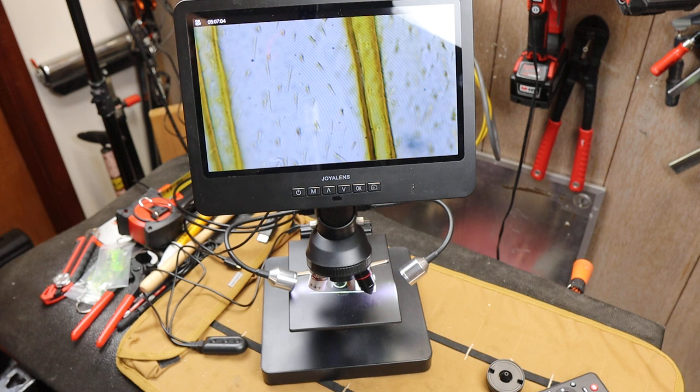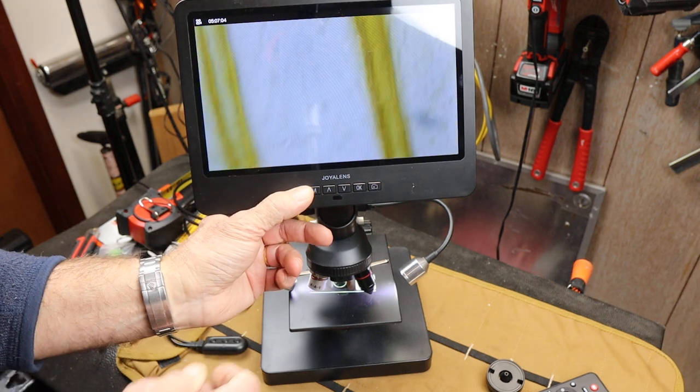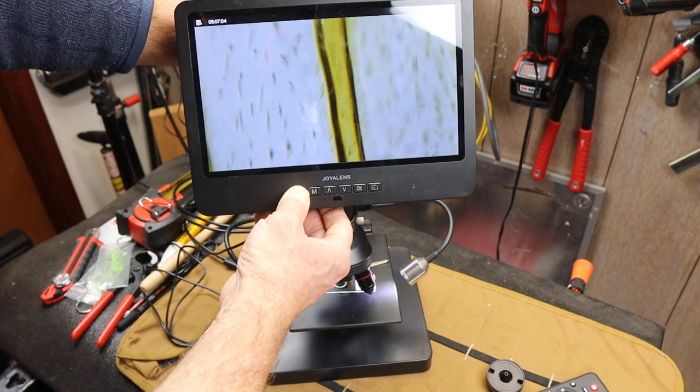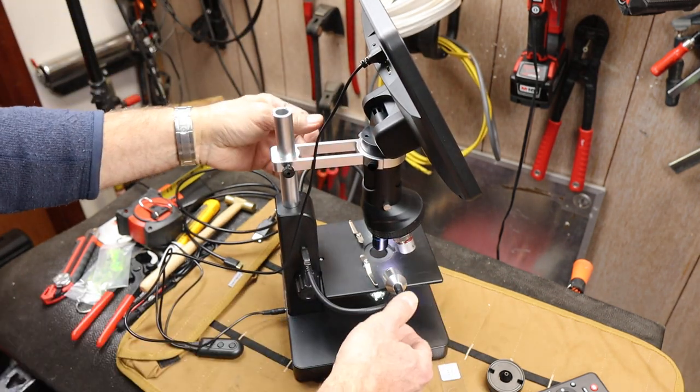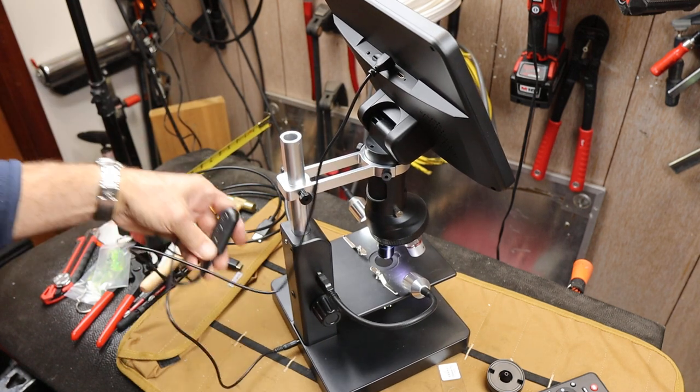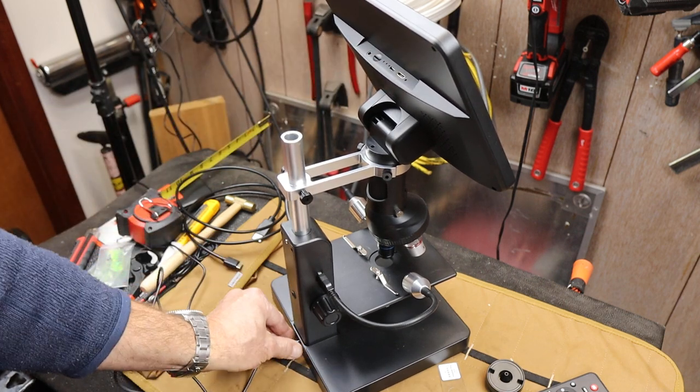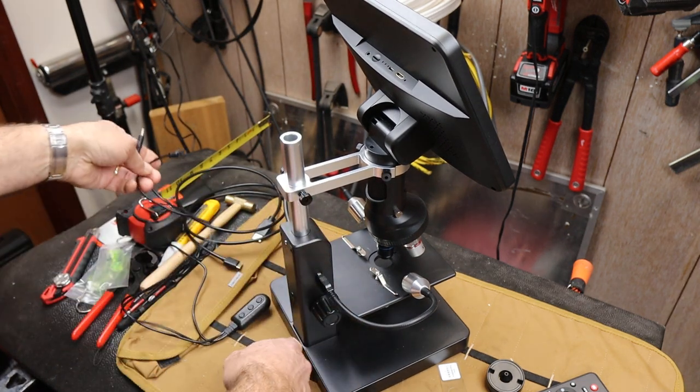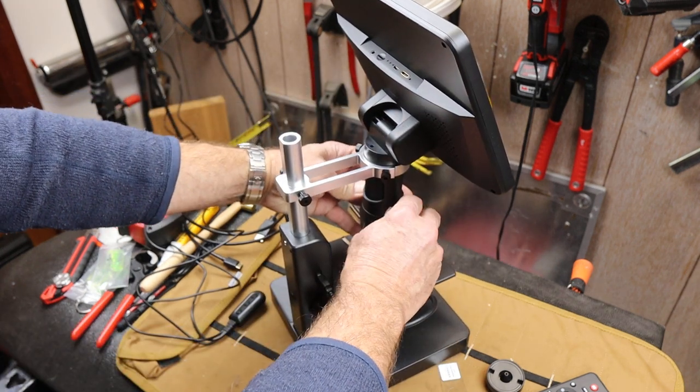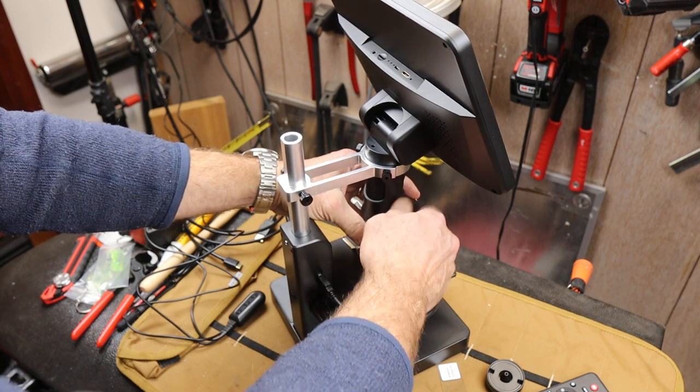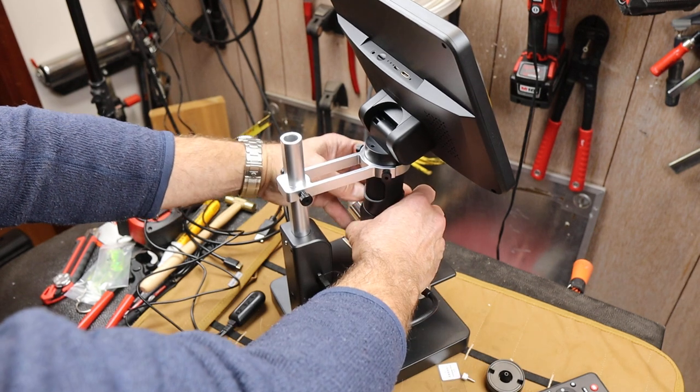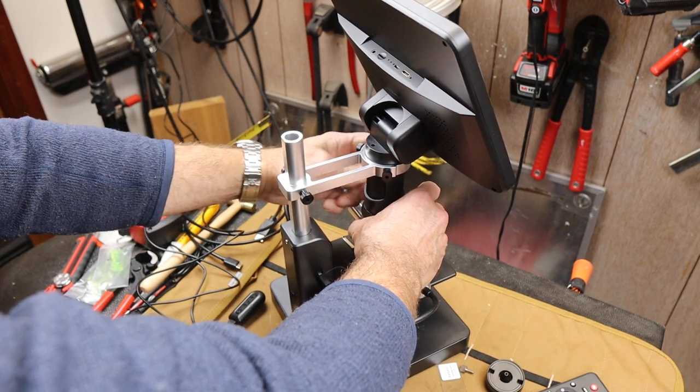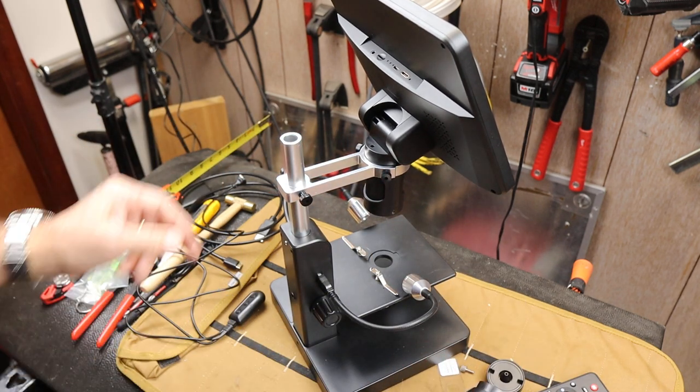But anyway, what is this like to put together? It comes in a small box. So first of all, I'm going to shut it off here. It's got an off button on that side. Let's take a look at the back end of this thing. I'm going to turn it off at the power. I can disconnect the power. It's got two pieces, one at the base, one on the camera. I've got two set screws here. But first I have to take off the objective lenses, just so it fits through the collar. You can see it's all quite rapidly disassemblable. Very simple.